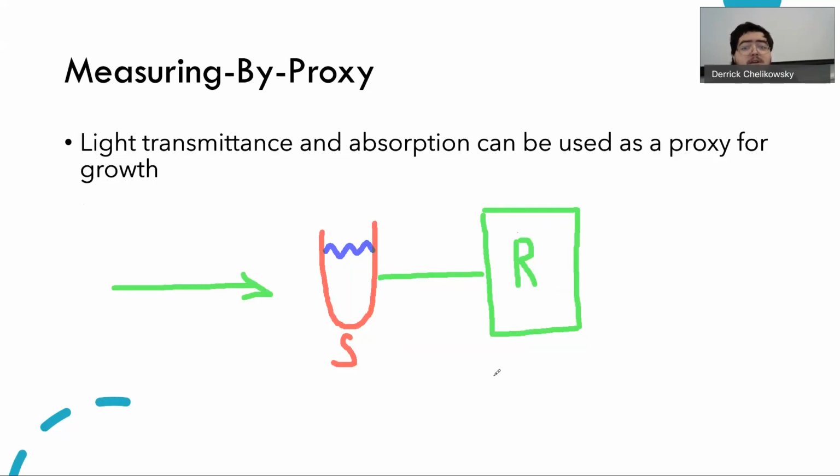We are not measuring out colonies. We are not doing colony counts. If you're working with algae like I did with this, we're not taking a subsample. Because of that, you're measuring not just live cells, but also dead cells as well. Dead cells also create turbidity. And that's important to note when you're using a spec.